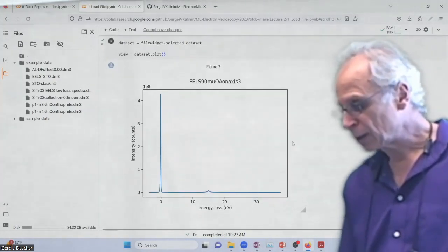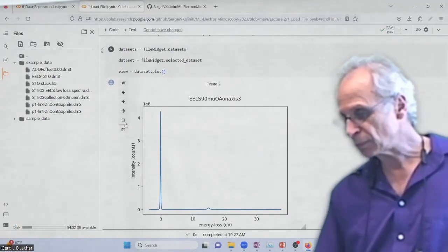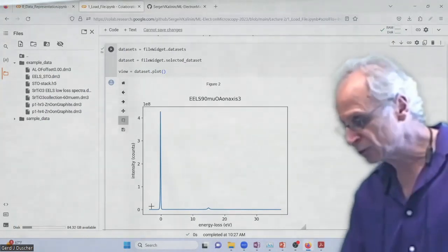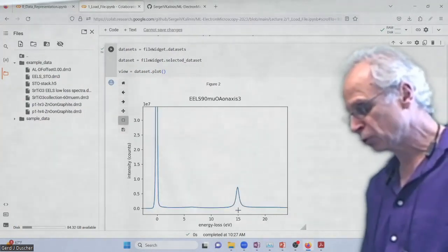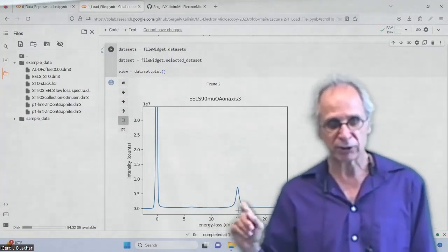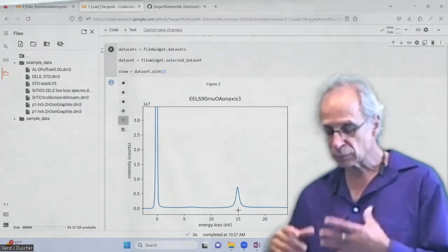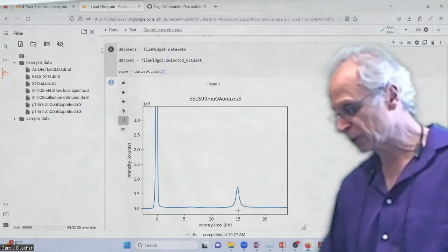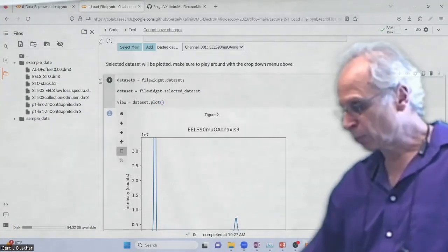The reason why we need an interactive one is obvious, because you really want to look into what is in this spectrum, right? And the dynamic range makes it necessary to look at that with some flexibility. So everything is in this plot thing.